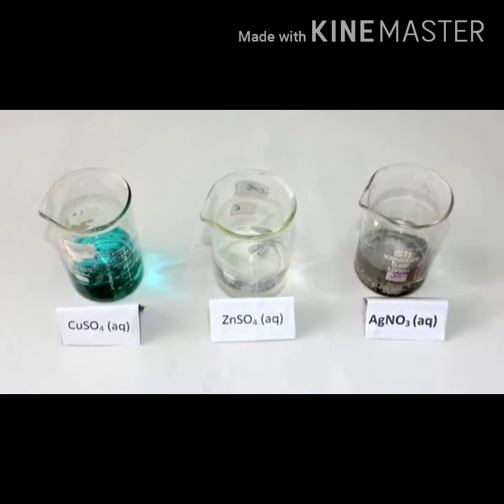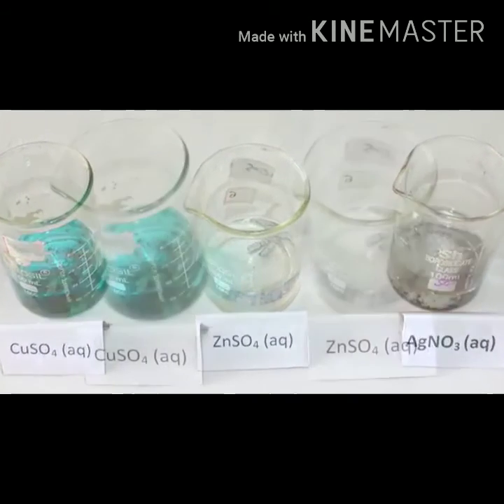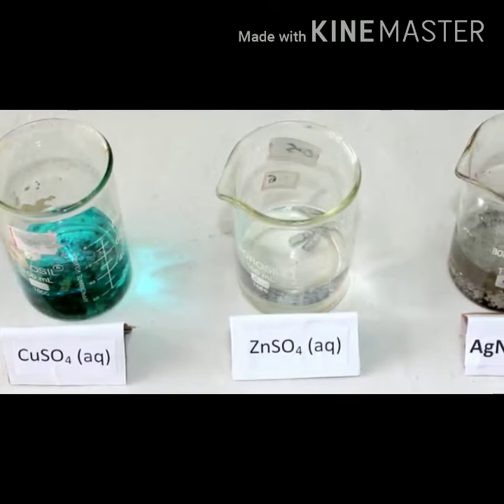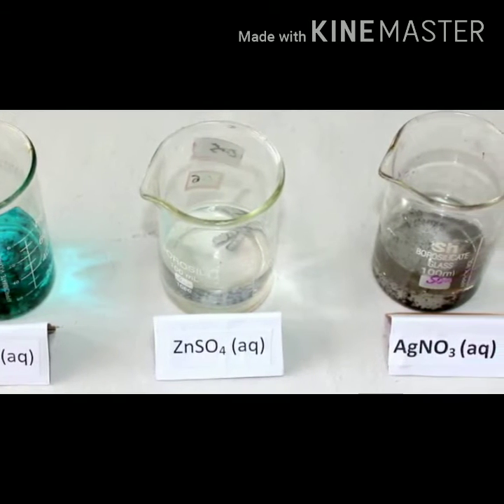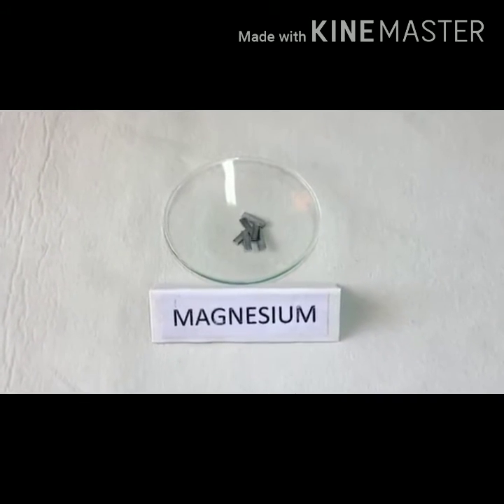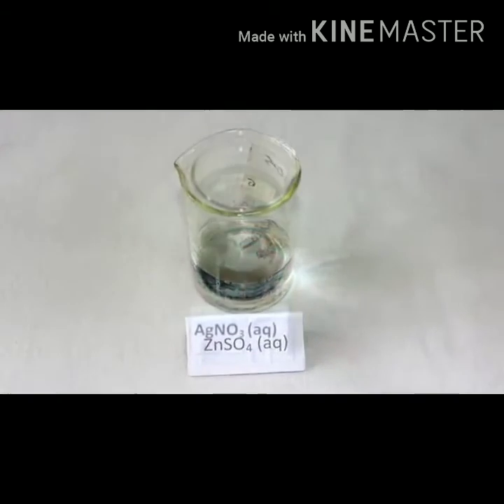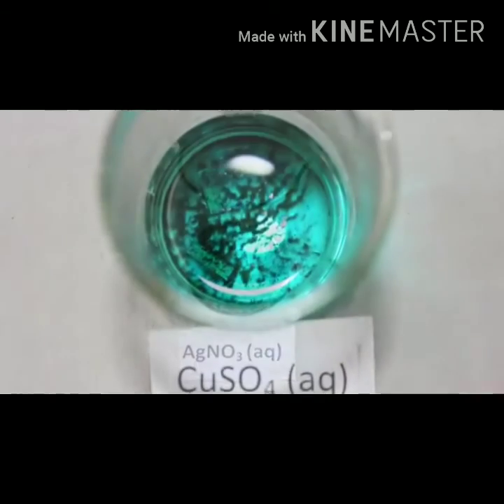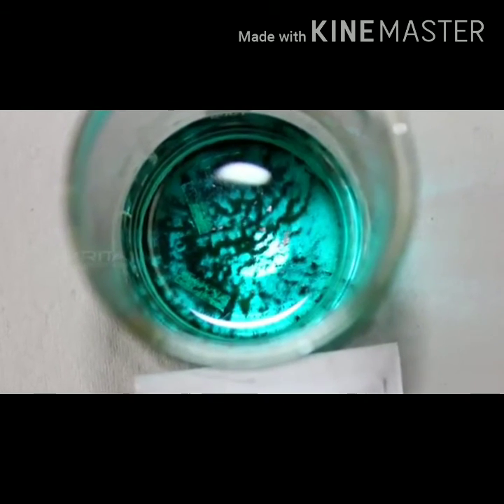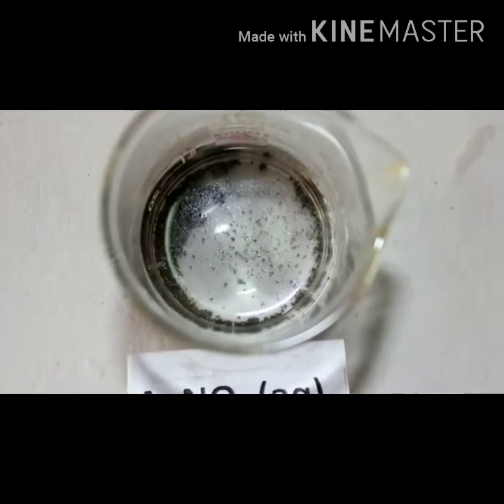After a day, we can observe that copper, zinc and silver particles settle down at the bottom of the beaker containing the respective solutions. This indicates that magnesium is more reactive than copper, zinc and silver. So it displaces copper from copper sulfate solution, zinc from zinc sulfate solution and silver from silver nitrate solution.